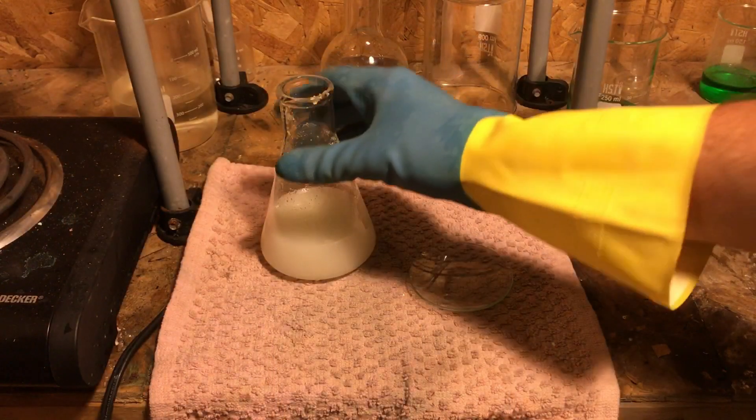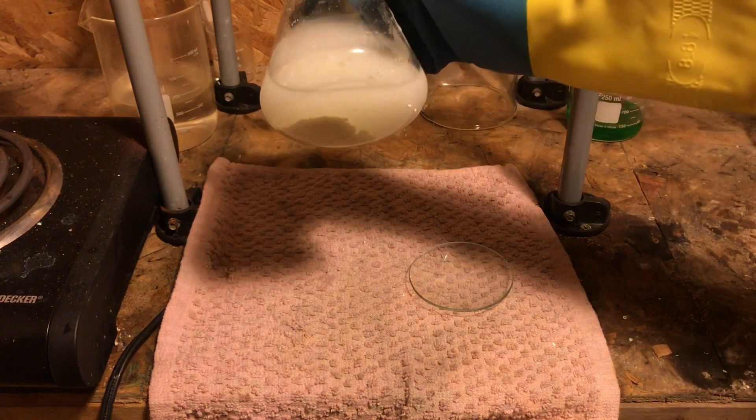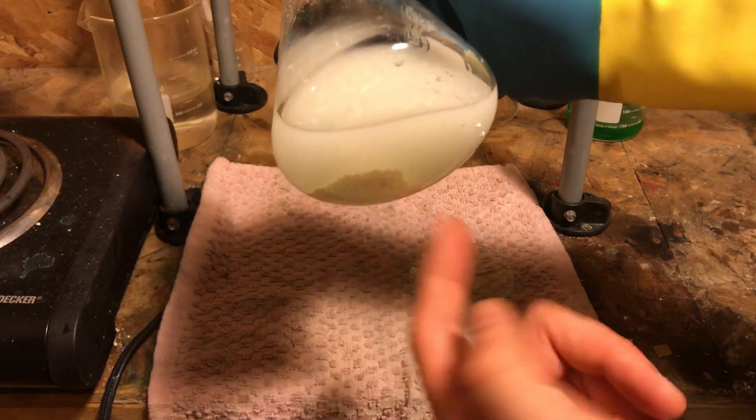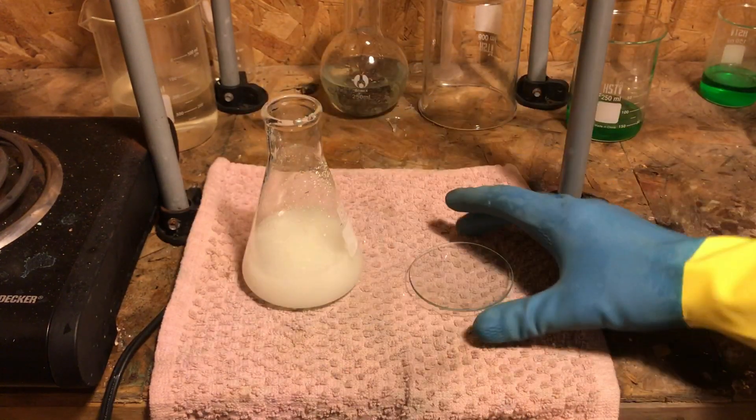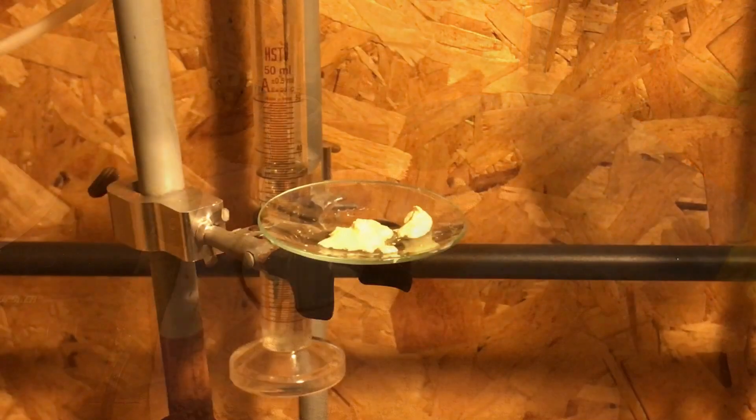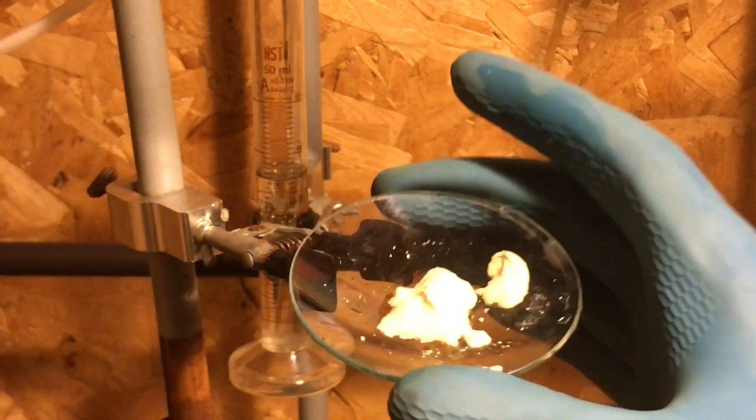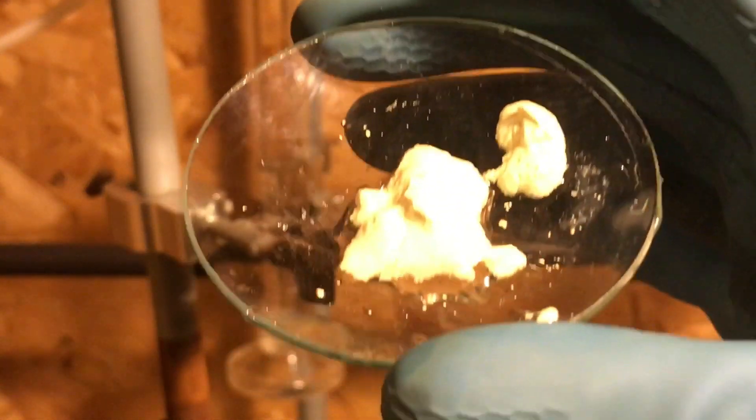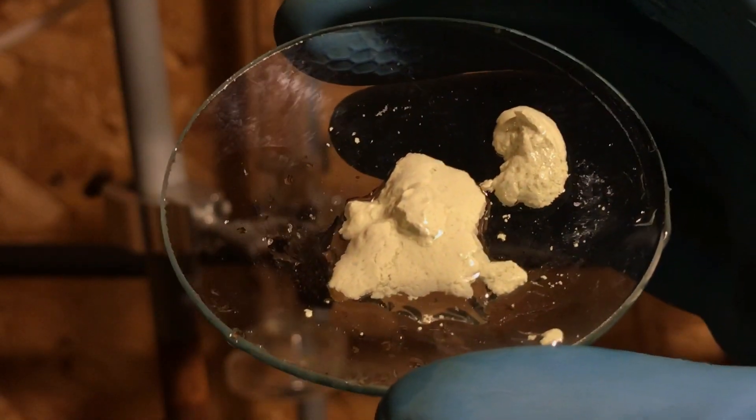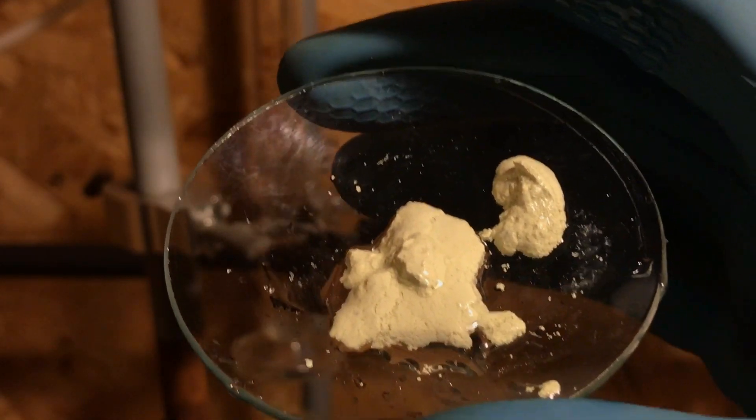I'm going to filter out the solution. I'm going to collect the silver bromide and place it in this evaporation disk. What you see here is the precipitate of the silver bromide that came out of the solution.